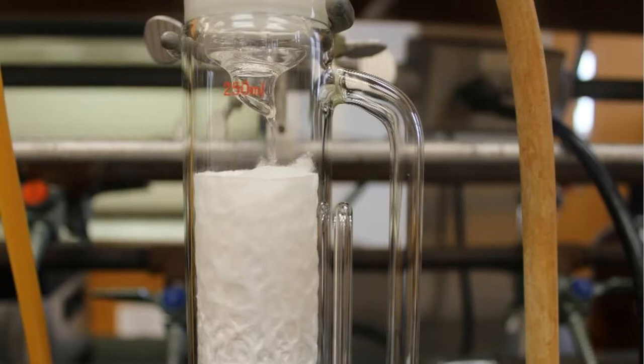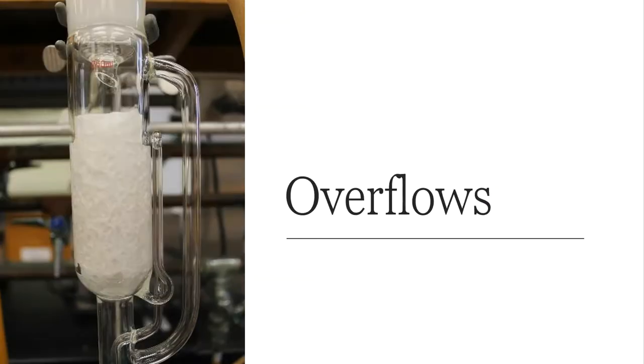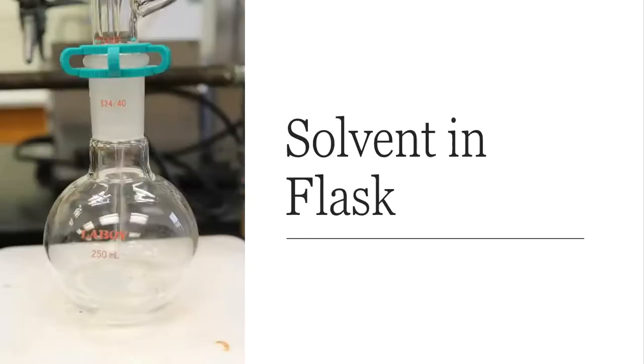All right, so here is the picture of the Soxhlet extractor. I'm filling the petroleum ether into this extractor. If you look at this picture really closely, you can maybe see a little bit of liquid layer that's here, and sooner or later, it's going to go to the top of that elbow. When it gets to the top of the elbow, it's going to eventually drain, and it will automatically dispense down into the Florence flask that sits below, and that's what you're seeing there in that picture. Just basically what I showed you in the video just now.